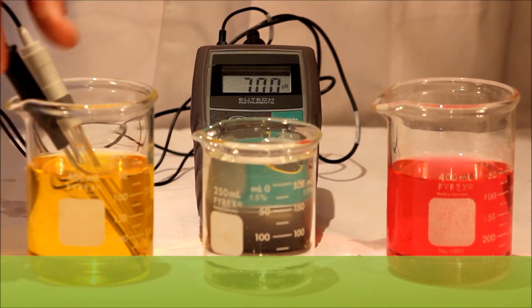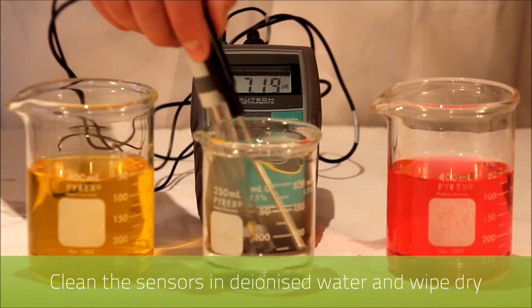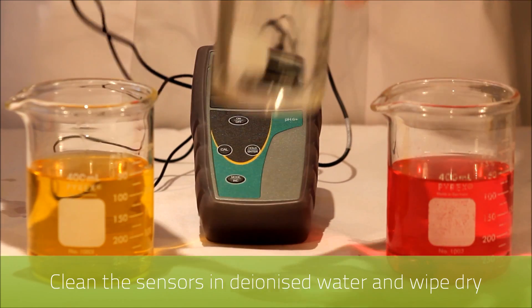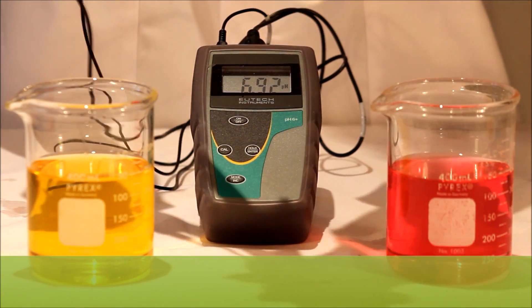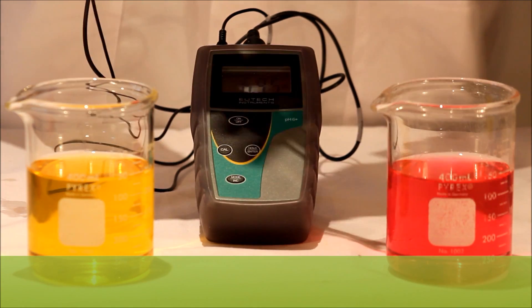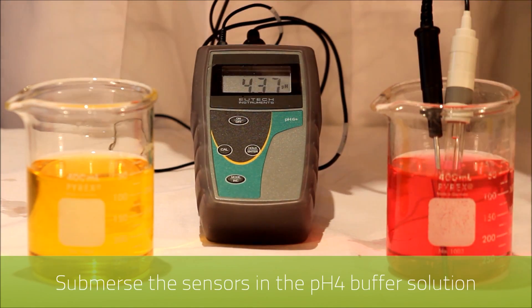Now we clean both sensors in deionized water and then wipe down with a soft tissue. Then we submerse the two sensors into the four pH buffer.